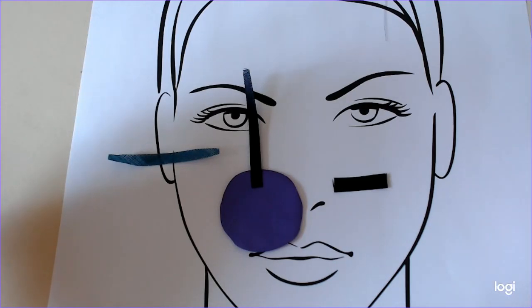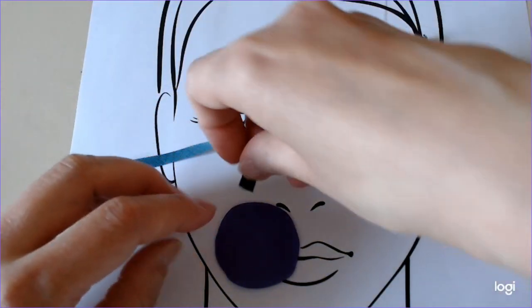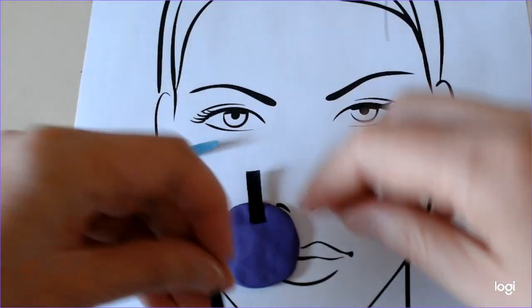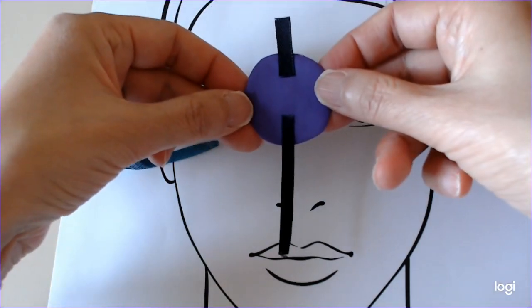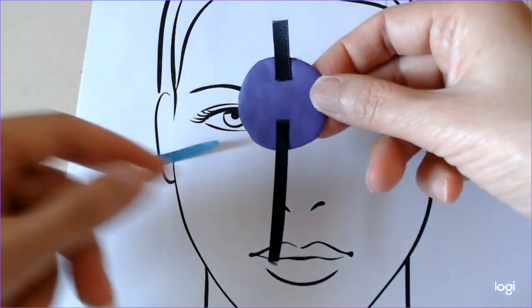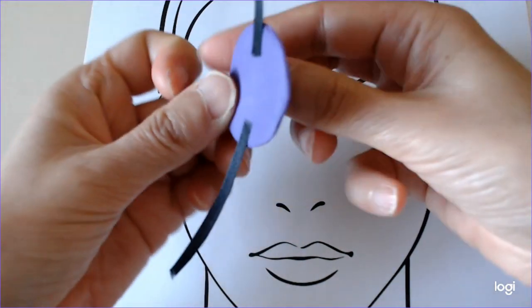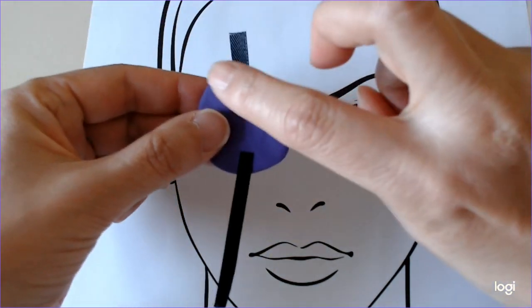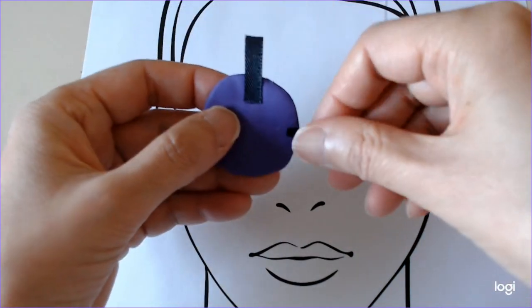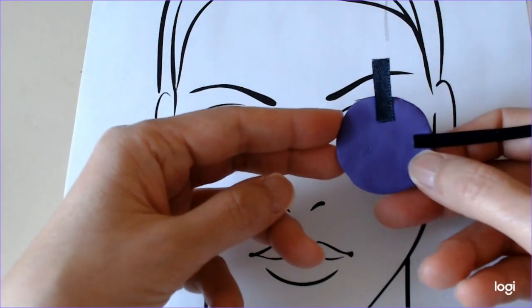My advice is to place sutures at 90 degrees to each other, and this is why. If you have a short suture at 12 o'clock and a long suture at 6 o'clock, the 6 o'clock one doesn't add anything — we already know that 6 o'clock is opposite 12 o'clock. And worse, if we don't know which surface is which, the two sutures don't help. Whereas if you have a short suture at 12 o'clock and a long suture at 3 o'clock, we can then also identify the front and the back.